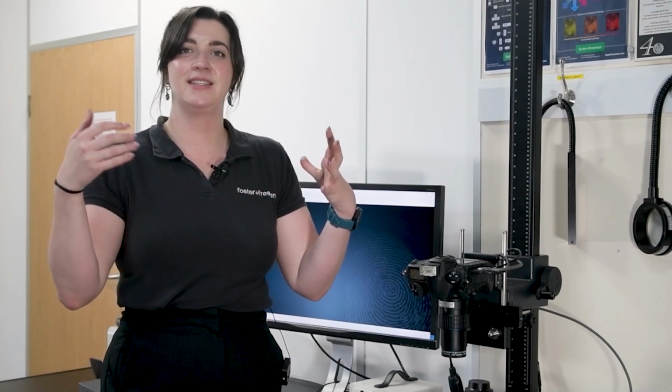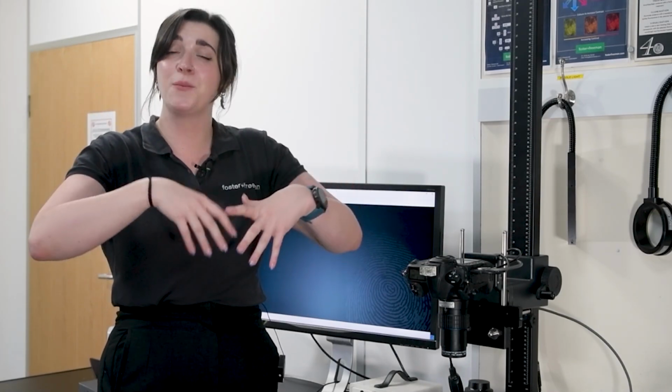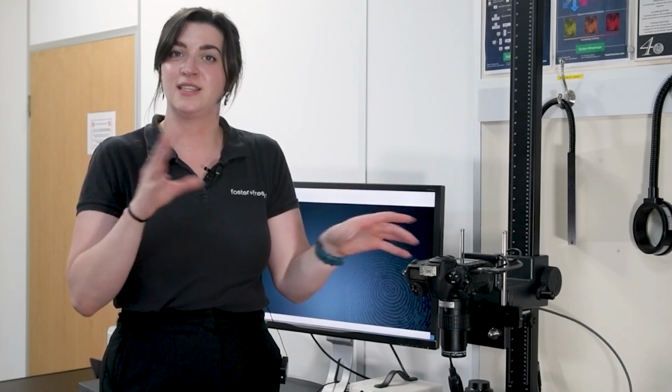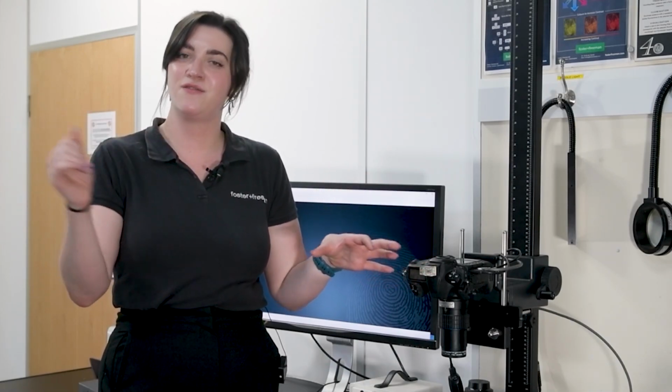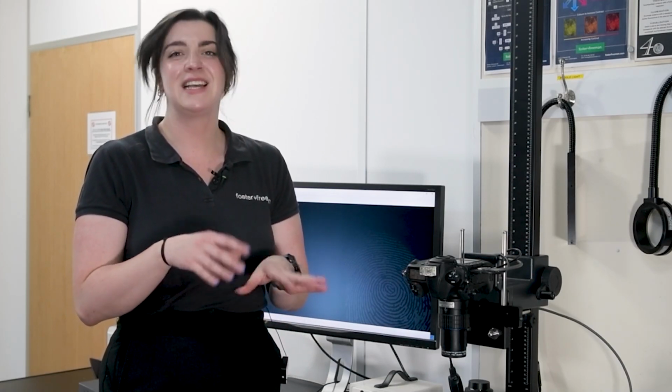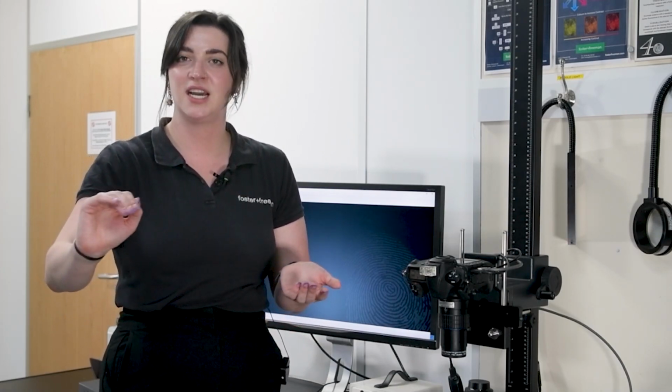But if our background is a little bit porous, what can happen is that the dye stain can actually sink into the background as well and be absorbed by the background as well. That means that when we come to do our fluorescence photography, our background is fluorescing at exactly the same wavelength as the fingerprint, and it can actually mask the fingerprint and make it much more difficult to see. So what we can do is actually sometimes miss out that dye staining part of the process completely.